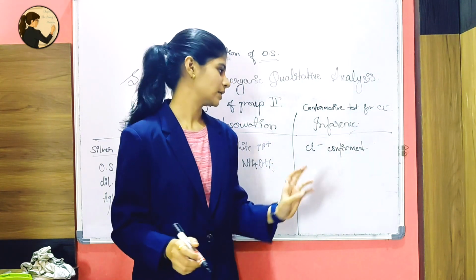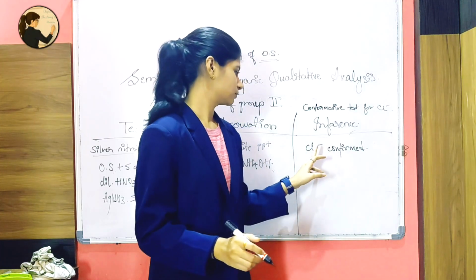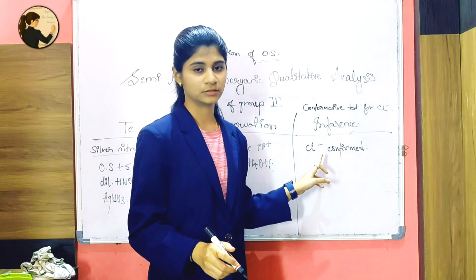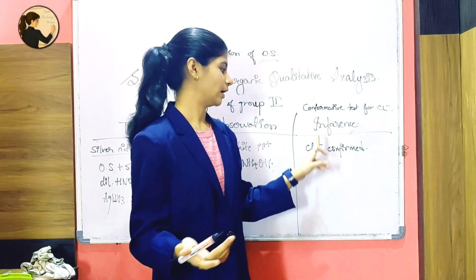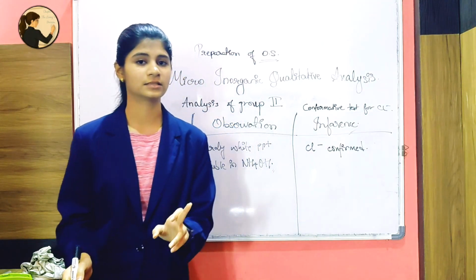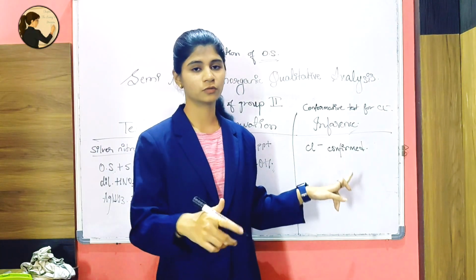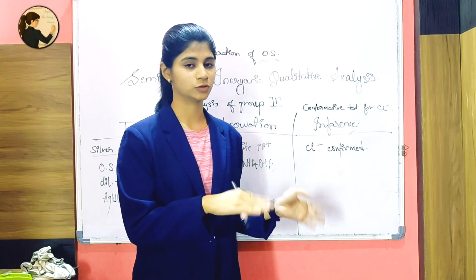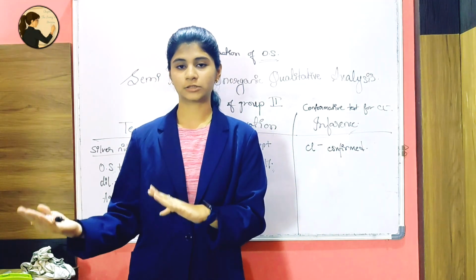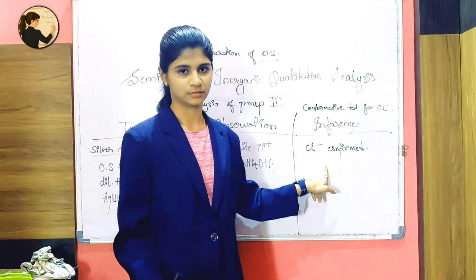Until and unless any of the acid radical determination is present, you should not go to further steps. Like after doing detection of acid radical, you should not jump into detection of basic radical. Before that you have to confirm which is present.